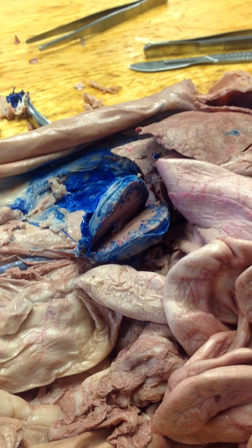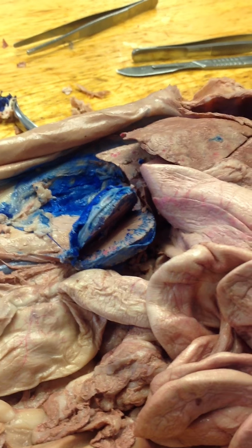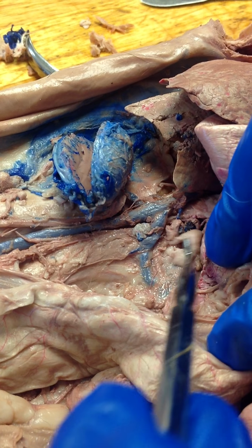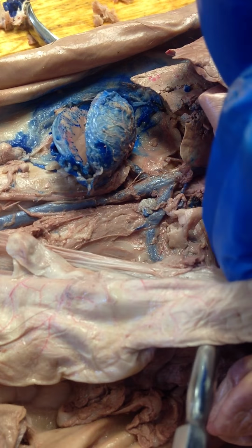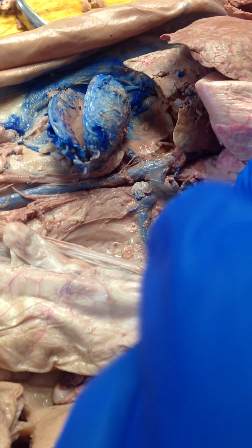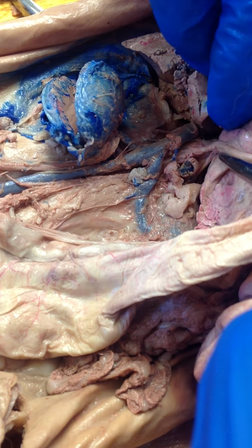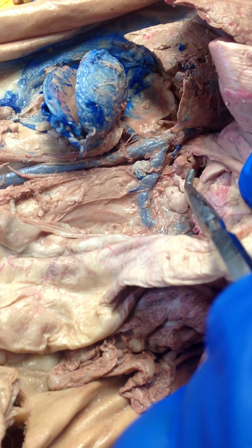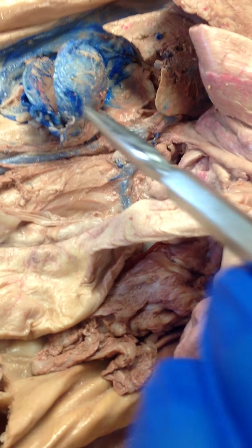Anyway. Next is the renal sinus, adrenal gland. We have to go on the other side. Where'd it go? Adrenal gland. Oh yes, here we go. It's actually chopped in half here, so here's half of it, and here's the other half of it. They go together, and they're the adrenal gland. And there isn't one on the other side apparently.